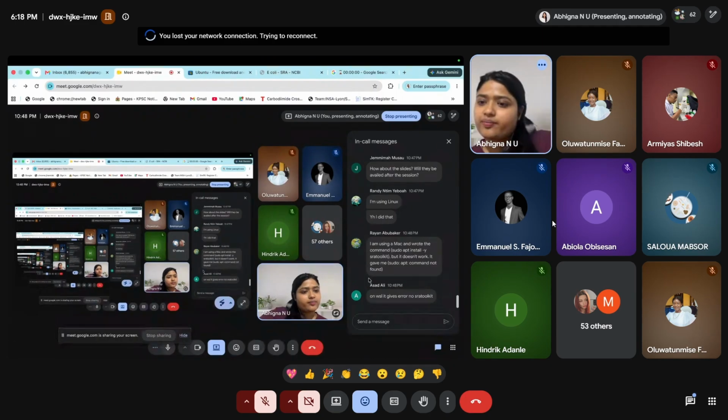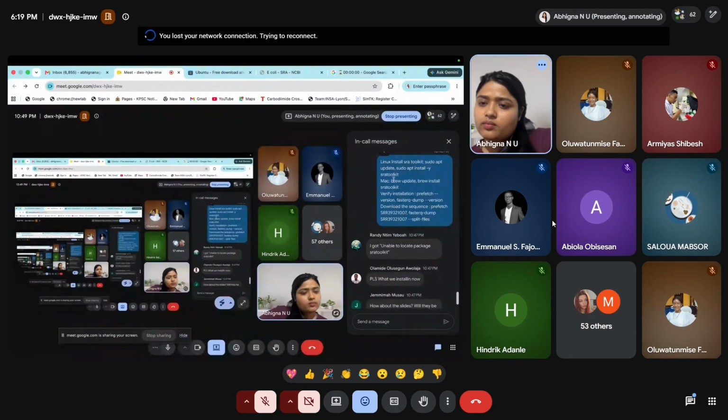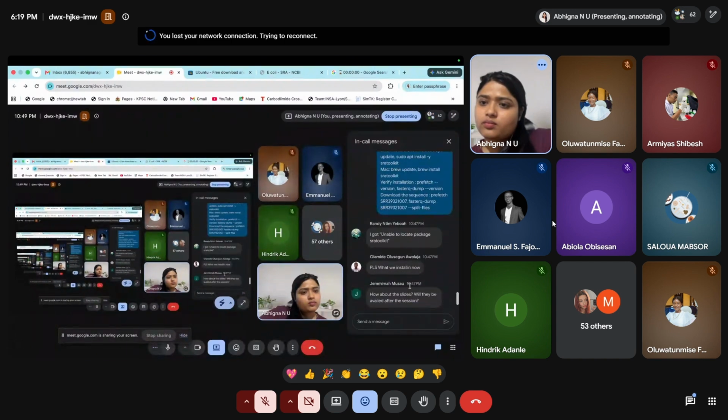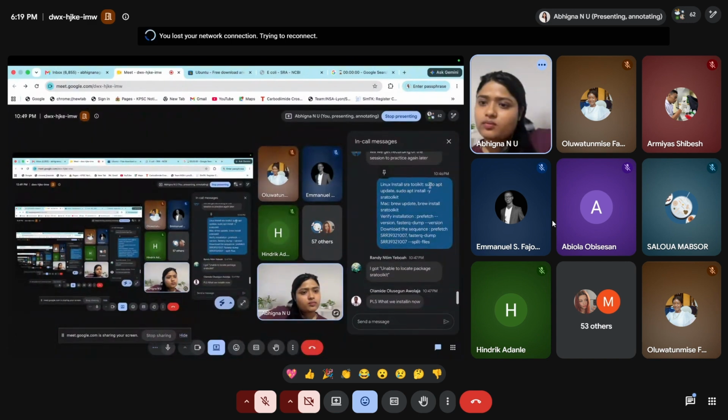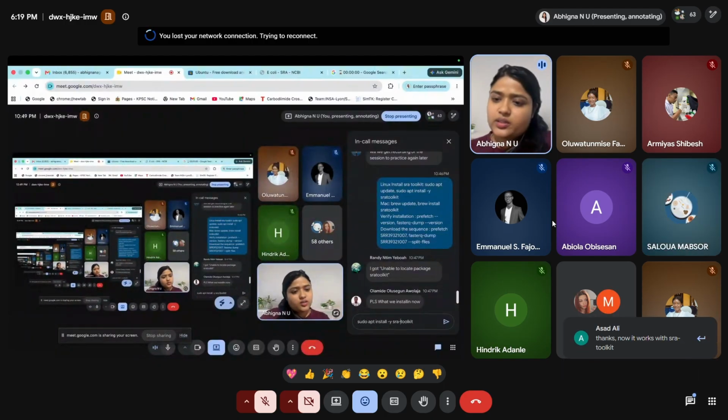Asad Ali. If the SRA toolkit download command doesn't work, I will go with this one.